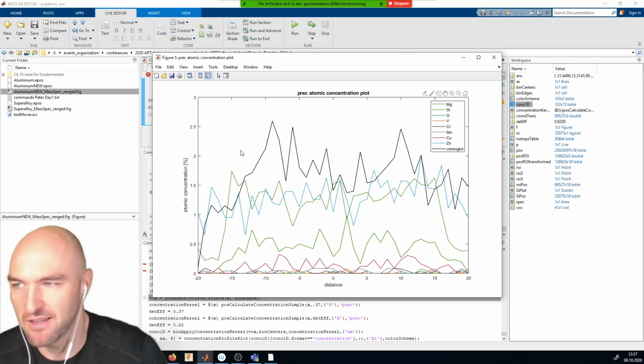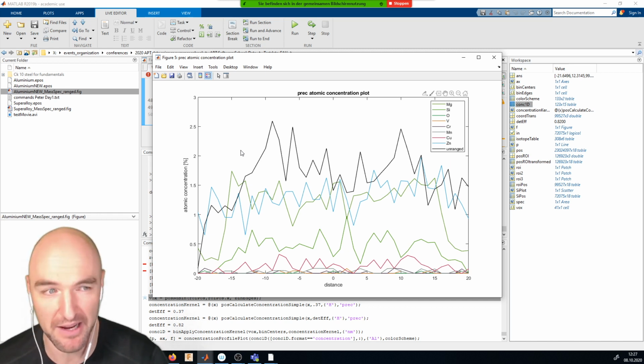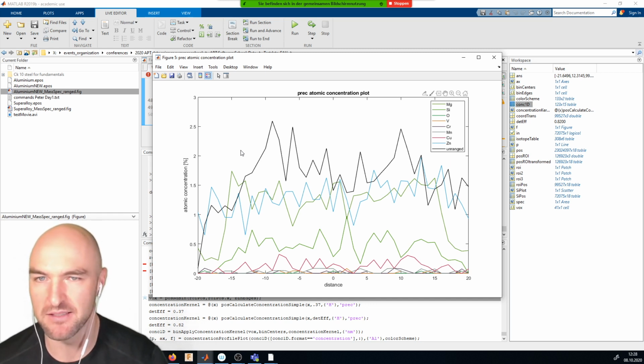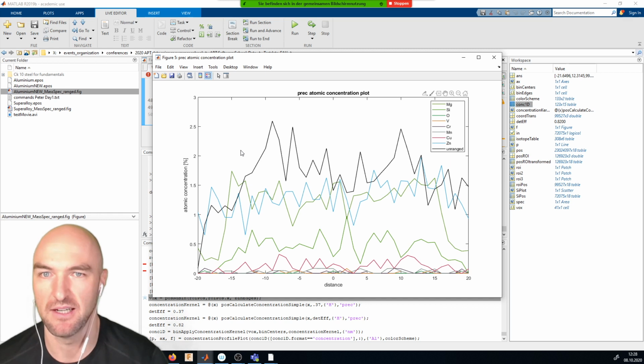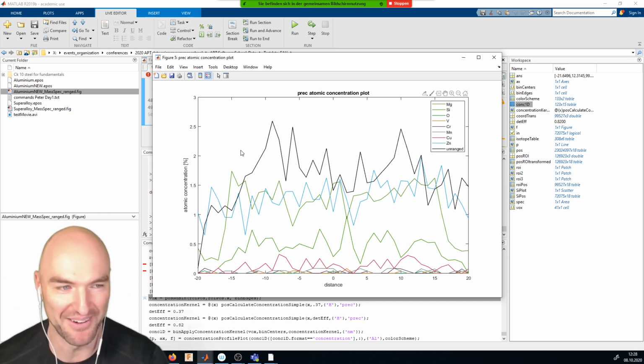And as Andy has already alluded to in very big depth yesterday, this is not the actual measurement error because the measurement error is defined by a whole lot more things that we usually don't have a very good grasp on. So I personally find it a little bit misleading to put the variance in as the error bar because it is not the error, it's just the statistical shot noise, which is not necessarily an error. Sorry, just to define, it's an uncertainty. It's an uncertainty, that's right. The variance is the uncertainty, but it's not the measurement error. Thank you, Andy.